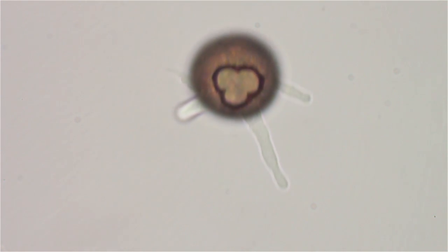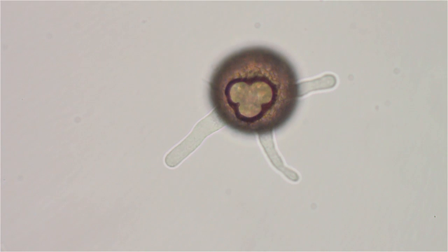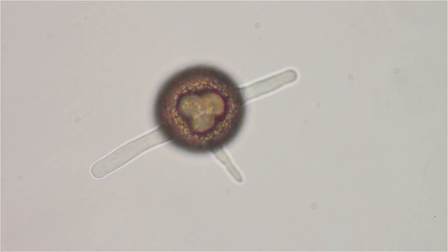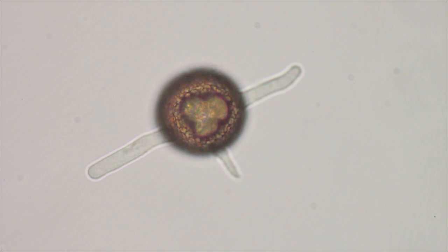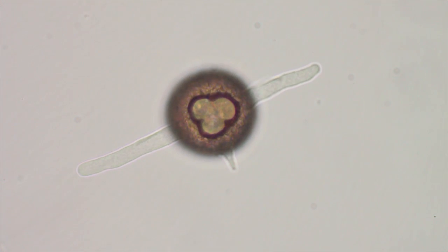I think we're just looking down through his jelly from the top of the shell. And that three-leaf clover opening there — that's on the bottom.